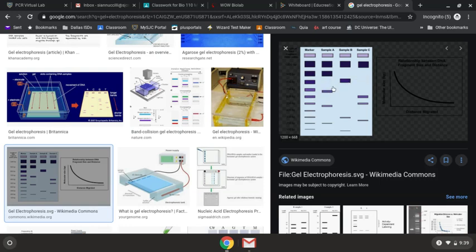This one has to be smaller than that, so let's say this one is 8. Sample A has an 8-piece segment. B does not. C does not because there are no bands. This one is 6. A does not have one. B does not have one. C has one. This one's 4, right? Sample A has a 4, and sample C has a 4, or something closer. Maybe that's 7, because it looks like it's a little higher than that one.